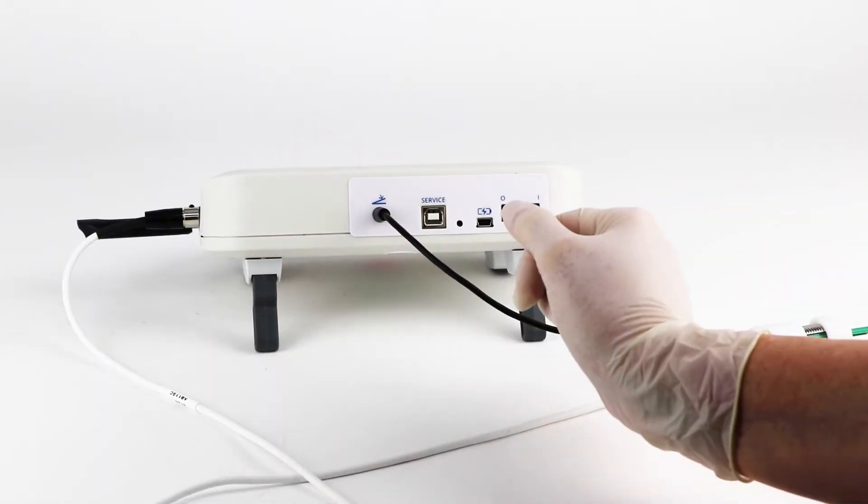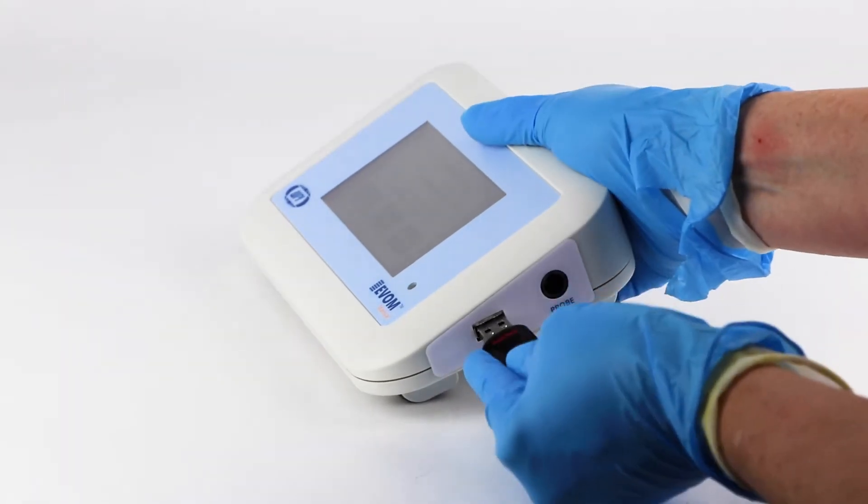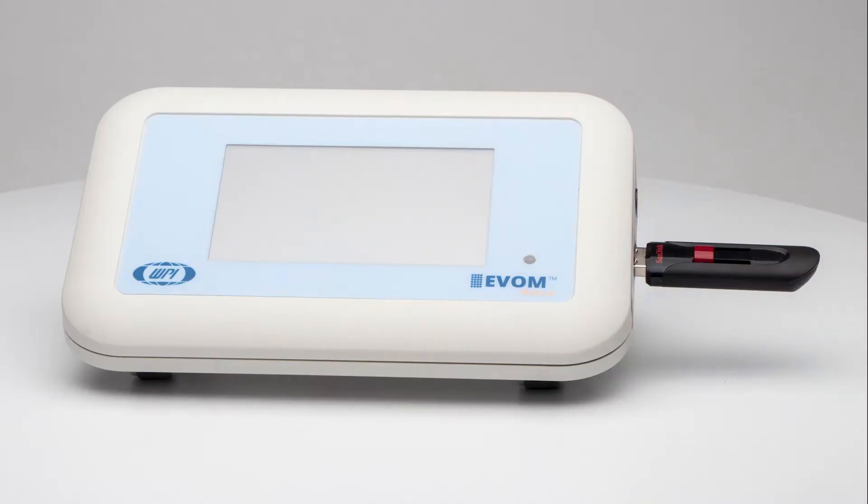Power on the Evon Manual using the power switch on the rear panel. Then insert the USB thumb drive provided with the system into the USB port on the side of the meter.